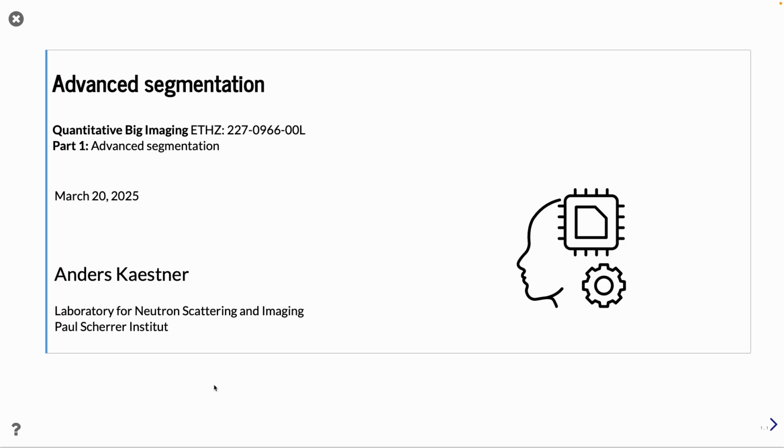And the missing part was actually how you can select a segmentation by looking at the histogram, seeing that there were two bumps, modes, in the histogram, and by putting a threshold between them, you can do quite a good segmentation. But that is manual work, and we don't want manual, in particular not when we do many images. We don't have the time for doing manual.